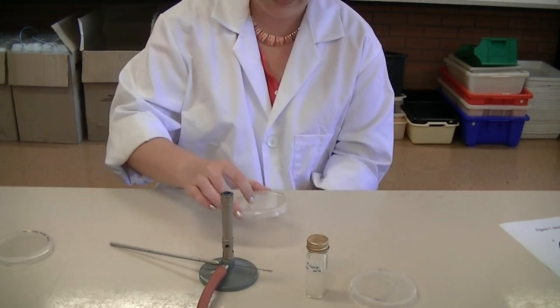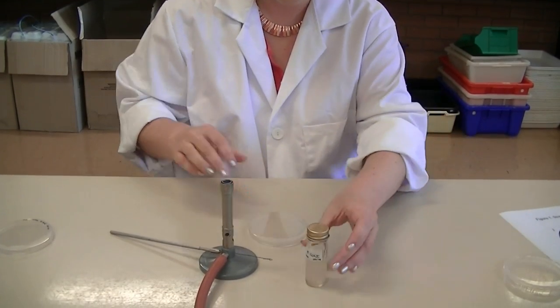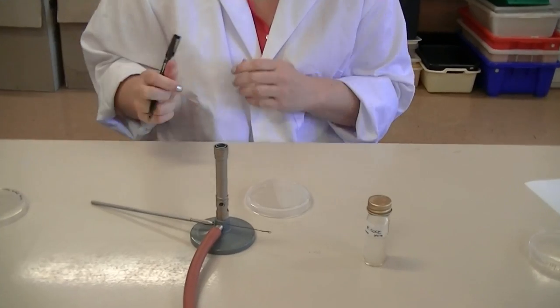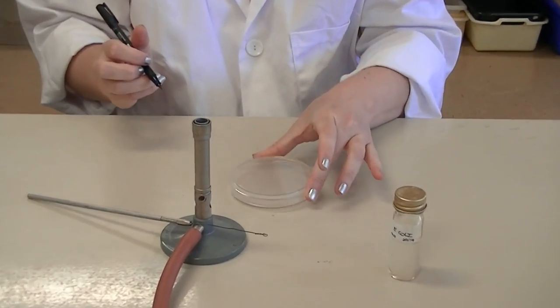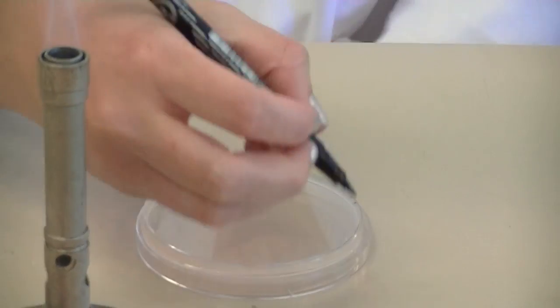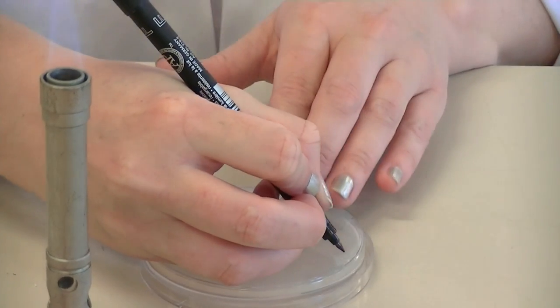You'll need a new clean plate, and again you'll need to label the plate. Turn your plate upside down and write on the circumference of the plate. Again, this is nutrient agar.